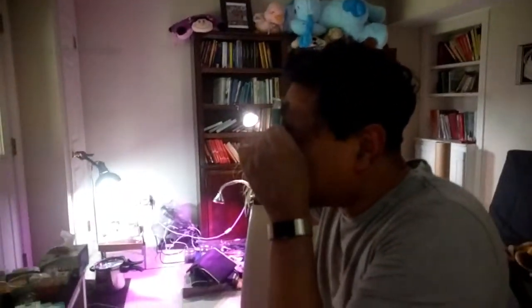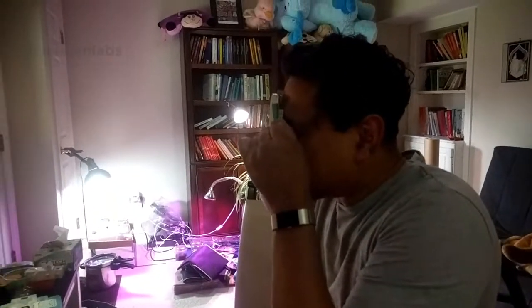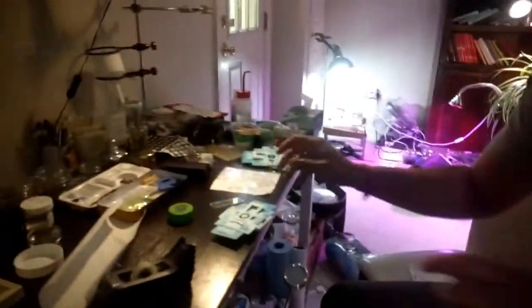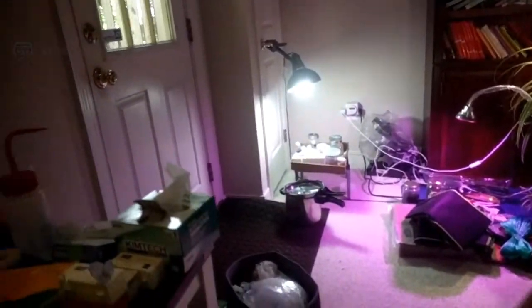Let's get it rolling. It's a bacterium called a Cyanobacterium. Okay, let's move this. So I've just loaded the slide. I have a culture of Cyanobacterium right there. And now I'm going to show it to you under the Foldscope.